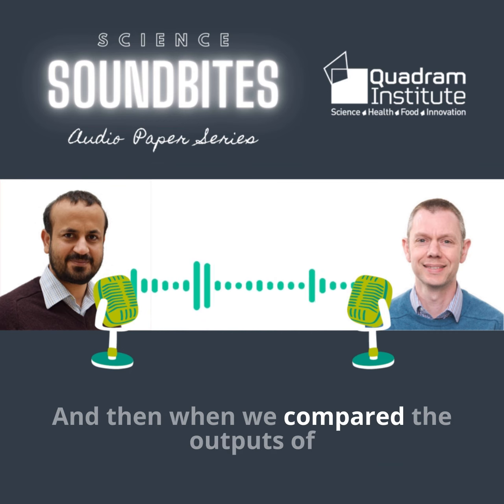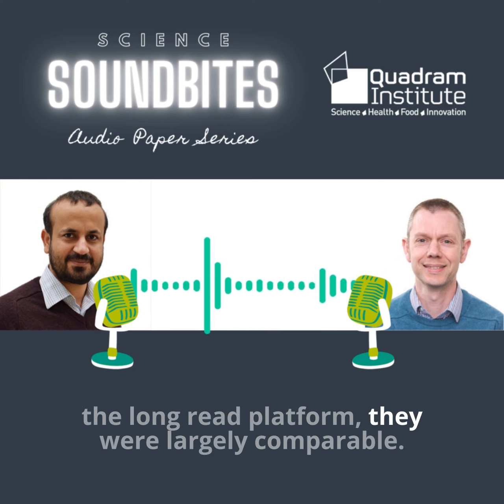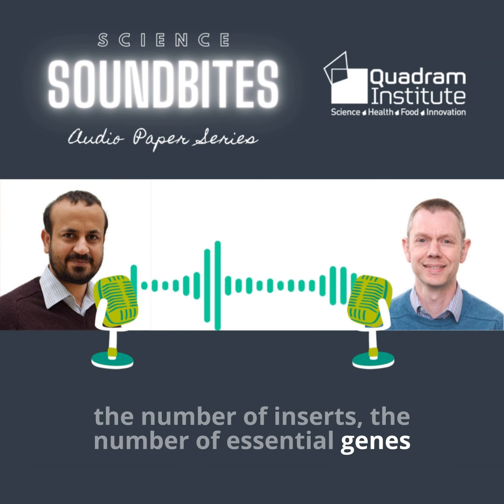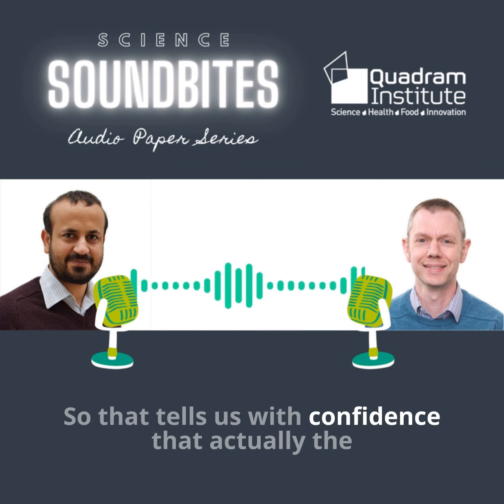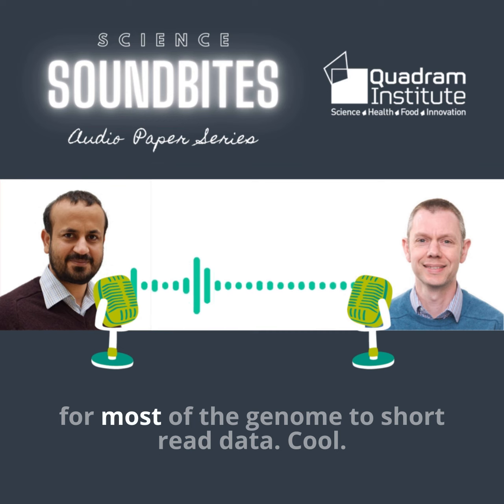And then when we compared the outputs of the data from the short read platform and the long read platform, they were largely comparable. So if you look at the position of inserts, the number of inserts, the number of essential genes that each method produced, they overlap very well. So that tells us with confidence that actually the long read method works, and it gives equivalent data for most of the genome to short read data.